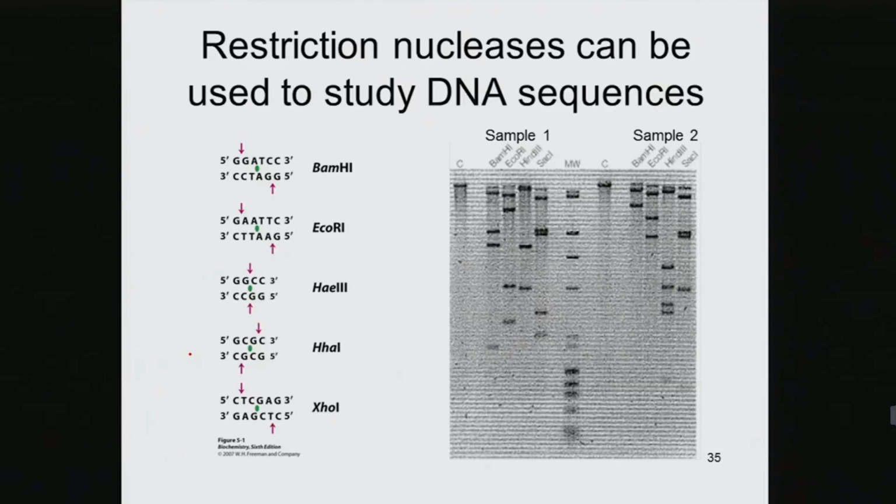So we would actually look to see if there are similar fragments being generated. I don't typically see anything that's very similar. So they're very different, distinct DNA samples that are being created, or fragments being created here.